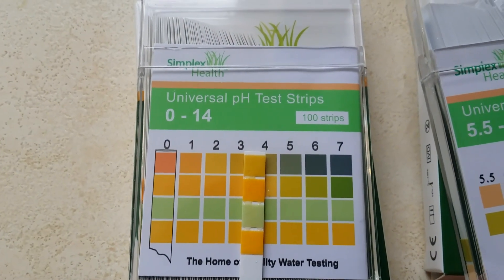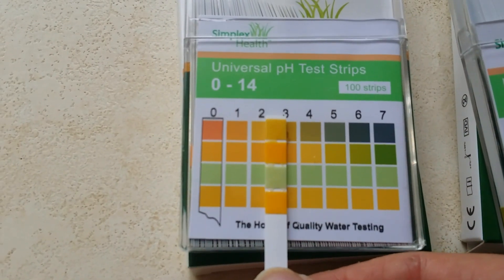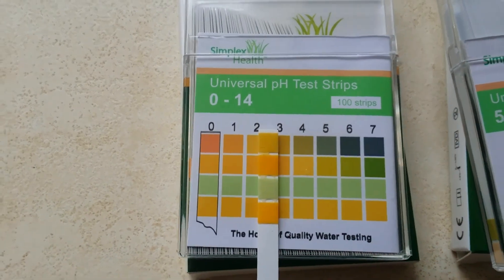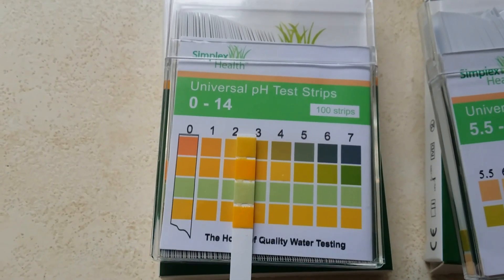Now because it's in increments of 1 it could easily fall between the two results. I think on this occasion it's probably fallen somewhere between 2 and 3, but that gives you a really good guide of what the pH is.